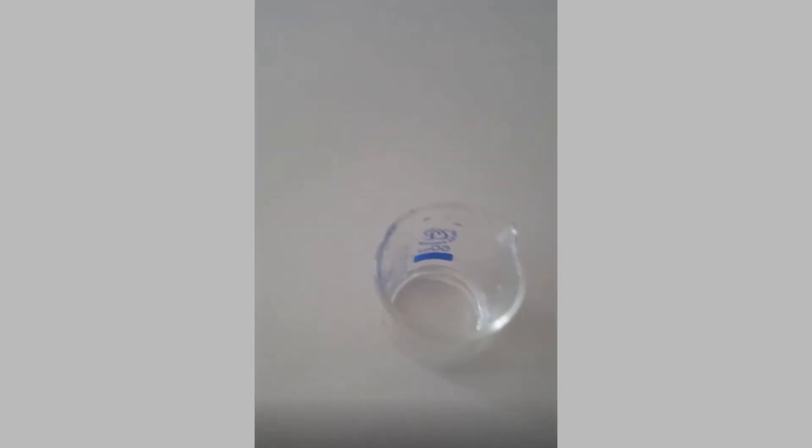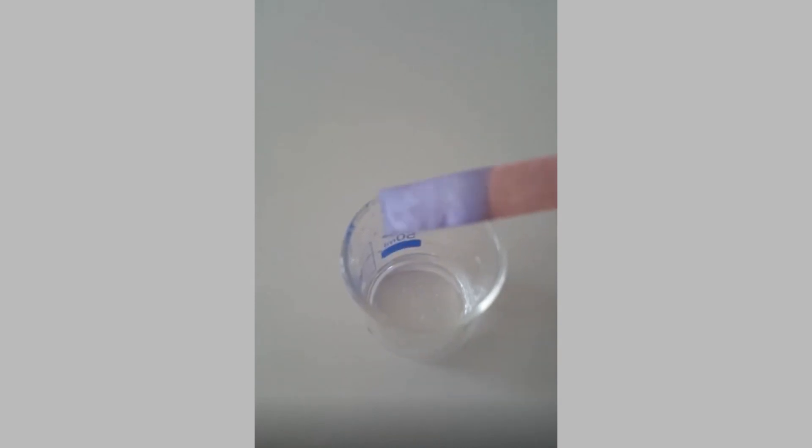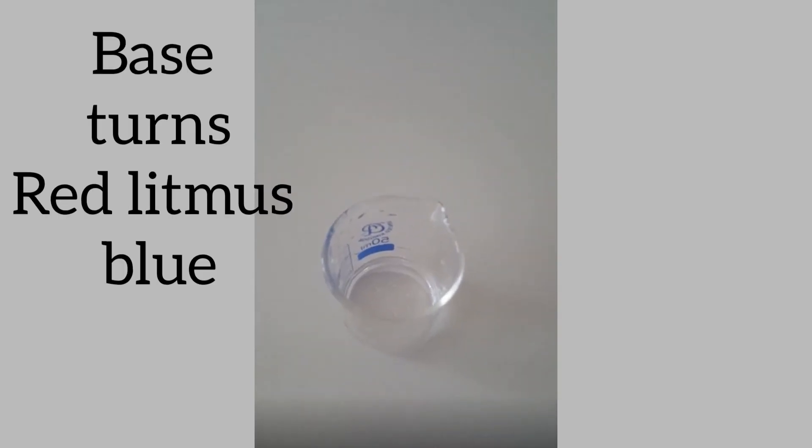Now, let us do the experiment with the second solution. I am putting the red litmus paper now. Wow. The color changes to blue. So, base solution changes red litmus paper to blue.